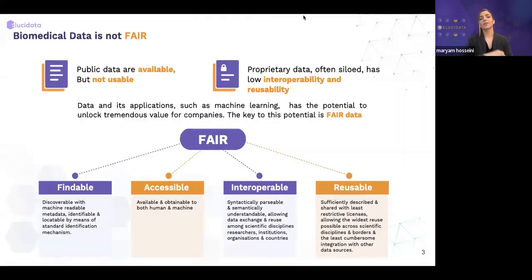Okay, so the first thing that I started my talk about was really the problem of curating the data and having clean data and actually making it ready for downstream analysis. Usually the data in public platforms is generated from different labs and different scientists with different goals and purposes. They've generated this data, and it is not consistent. The file formats are not consistent, and also the metadata fields are not consistent. They're not following the same ontology.